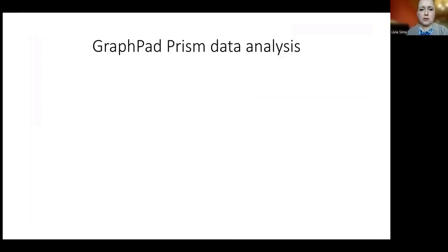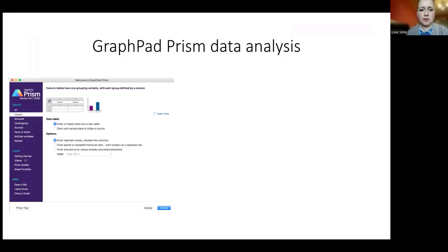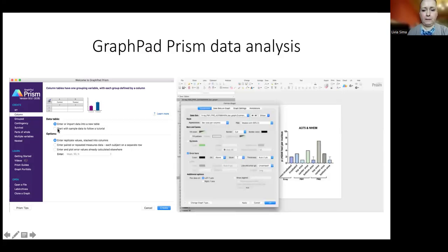And then with this exported Excel list, we have opened the GraphPad software and chose a column graphing method to compare the treated samples and untreated controls, and to obtain such bar graphs that can be further modified to generate colored graphics and to label them based on the treatments the cells were exposed to.